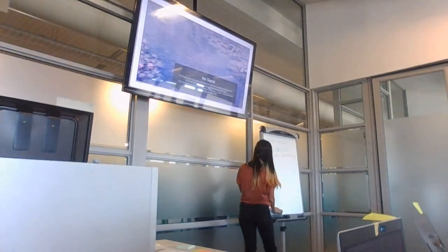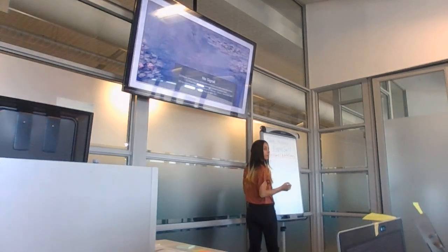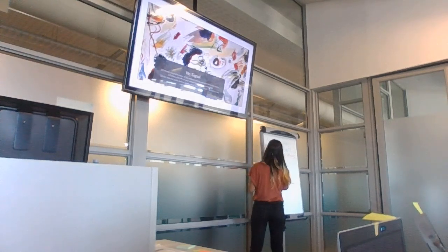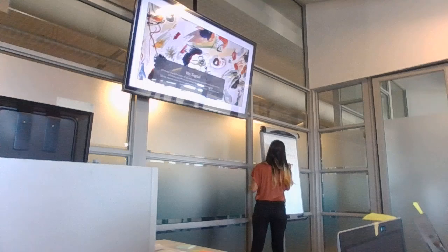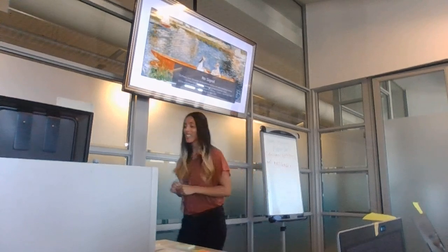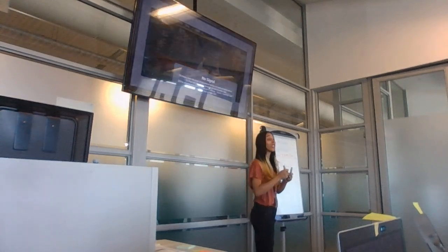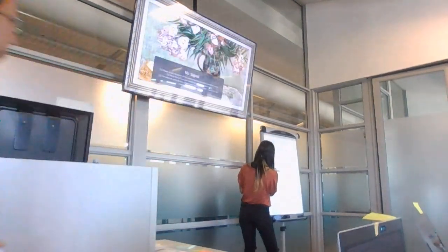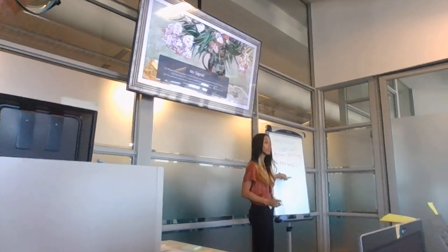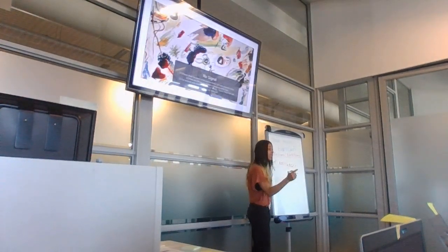Okay, let me draw this again. Here's your reference. You cannot tell me you're loading things that are not equal in size and they give you the same result. Yes, I am, I will show you. Let's say this is the reference genome. This is your reference. This is your forward reads, and this is your reverse reads. When we are saying this file is bigger than this one, we are not saying it's longer. We are saying it has more reads.